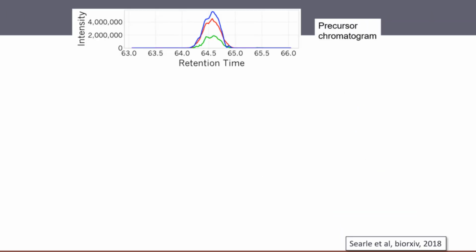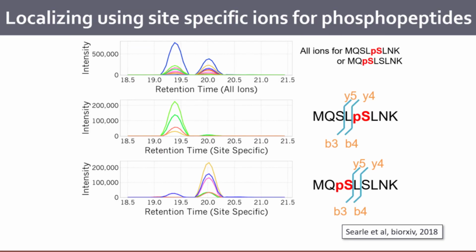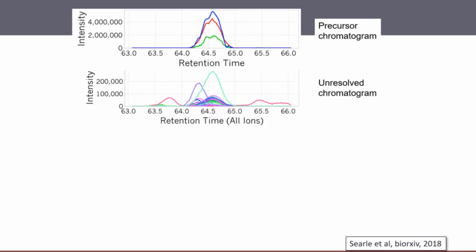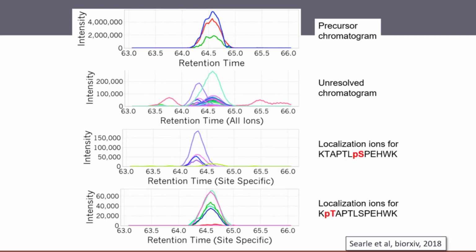So here's another example. Some people have said, well, I've got the MS1 data here, so why don't I look for other MS1 signals of the same mass, and we can integrate them. As long as I identify them enough times in multiple different runs, I can eventually figure them all out. But there are a lot of cases where they're not chromatographically resolved. You can actually look at the product ions that are unresolved, and you can start to separate the individual position-specific fragment ions. You can still see some of the gas phase rearrangement occurring in that case as well. Again, this is another interesting case.